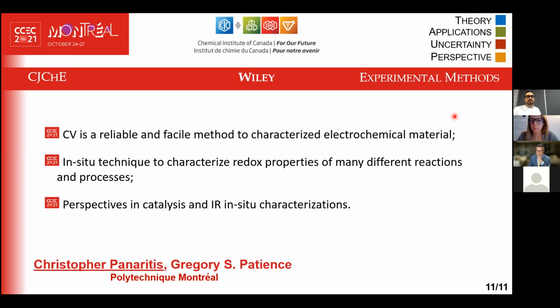So our question is, how can we tell if it's strongly absorbed on the working electrode, or is it from the solution when we conduct the cyclic voltammetry? That you have to do in different steps. So we have to test your different hypotheses of what's absorbed. There's no way really to tell. You have to always have some reference.